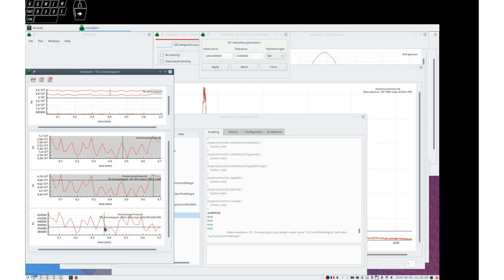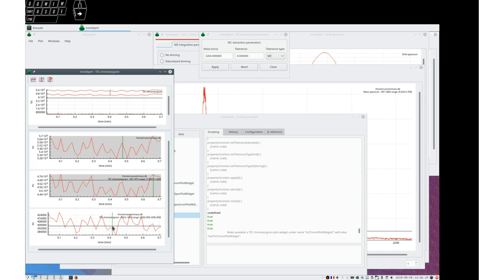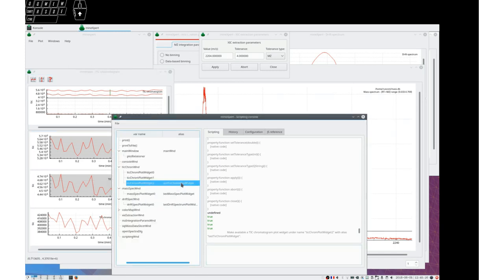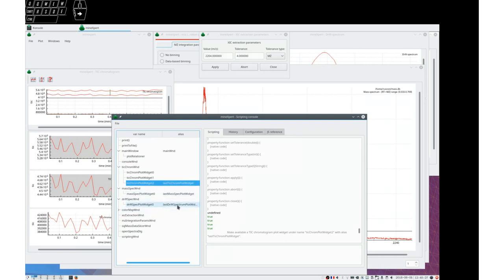And the corresponding plot widget has been produced. How do I capture the identity of this plot widget? Very easy. I know that each time a plot widget is created, it has an alias that is last. Last tick chrome plot widget, last mass spec plot widget, last drift spectrum plot widget.